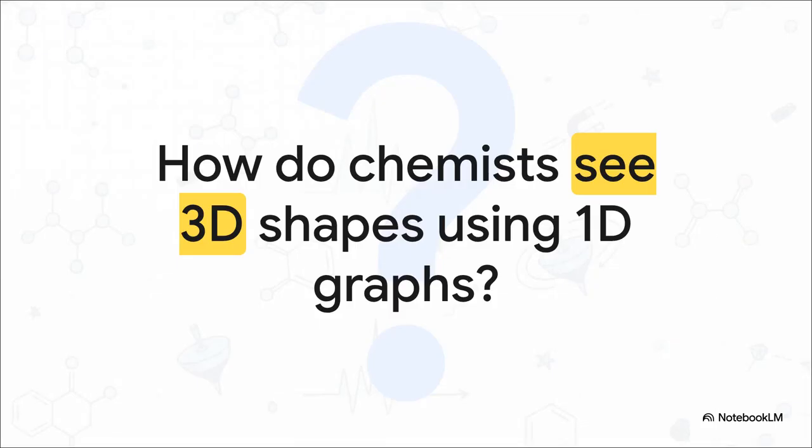So how do we actually do it? It's a literal detective story, mostly because standard NMR has a massive blind spot. It is completely blind to enantiomers. Think about it. If you toss a pure R enantiomer and a pure S enantiomer into a standard magnetic field, they are going to spit out perfectly identical spectra. In an achiral environment, their protons are processing at the exact same frequencies. For anyone trying to solve a structure, that is a huge roadblock.